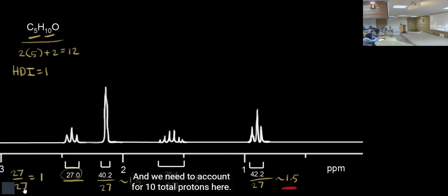So if you think that this is not one, maybe it's an impurity, right? But NMR technicians don't have such an idea, so you can do it by yourself. You can get the FIDs, the free induction decay, and then process it by yourself, or you can ask them not to consider this peak and to consider this one as one.